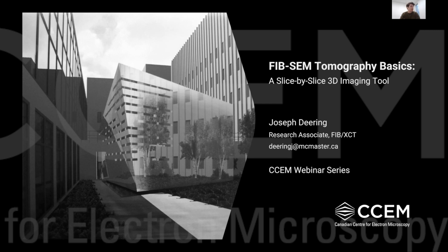So today I'm happy to be talking a little bit about one of my favorite techniques in the field of microscopy, and that's FIB-SEM tomography, really looking at a slice-by-slice breakdown of material science in the micro scale.